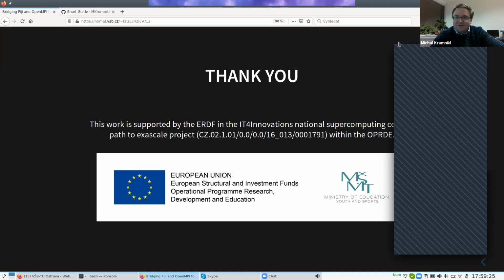And now we have the last 15 minutes for your questions. So feel free to ask whatever you need, or maybe try to describe what sort of job you are doing, and maybe we can help you to find out how to make it faster, smoother, or how to run it on a cluster. So feel free to talk.